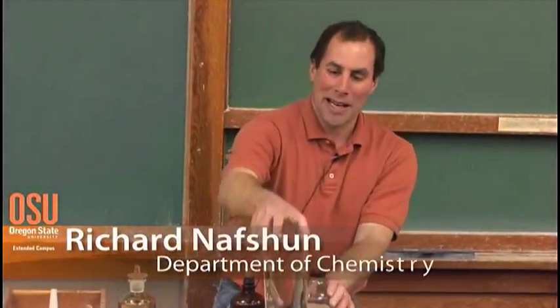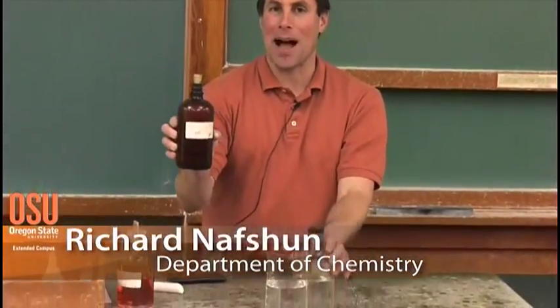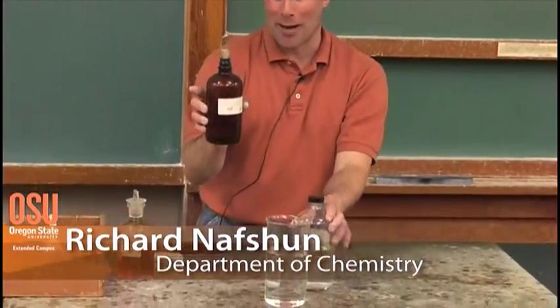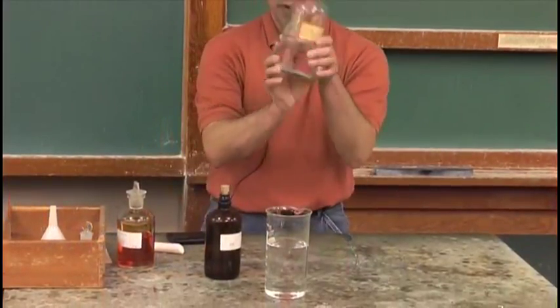Hi, I have a beaker of plain deionized water and a solution containing some potassium iodide, and I'll show you the formula and reaction up on the board in a moment, and some lead nitrate.